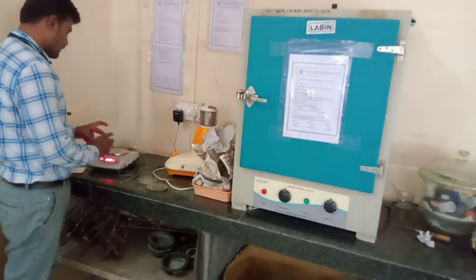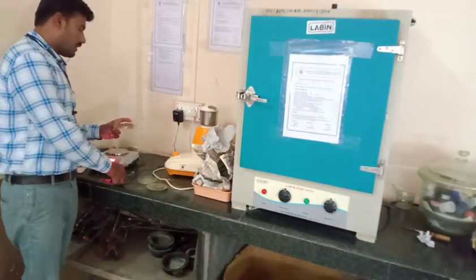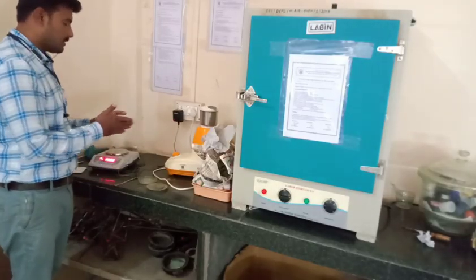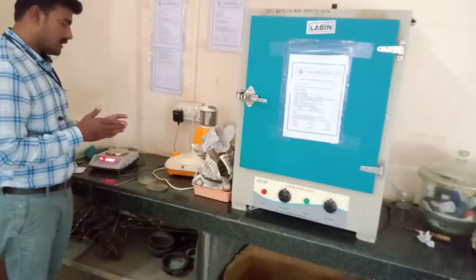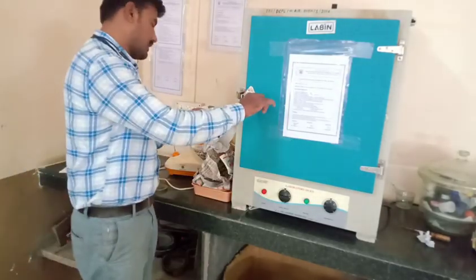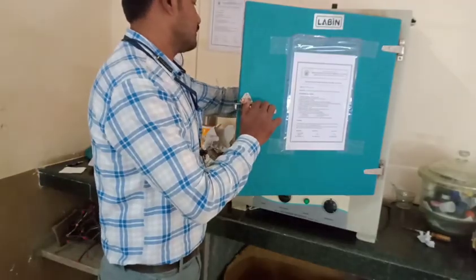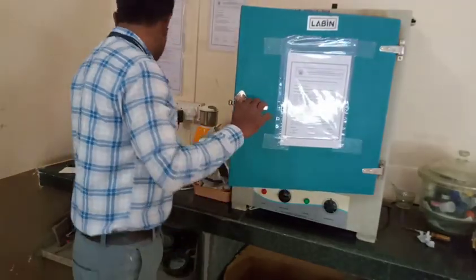Now take the petri dish with the crude drug and keep it for drying. Spread the crude drug all over the petri dish and keep it for drying in the oven.